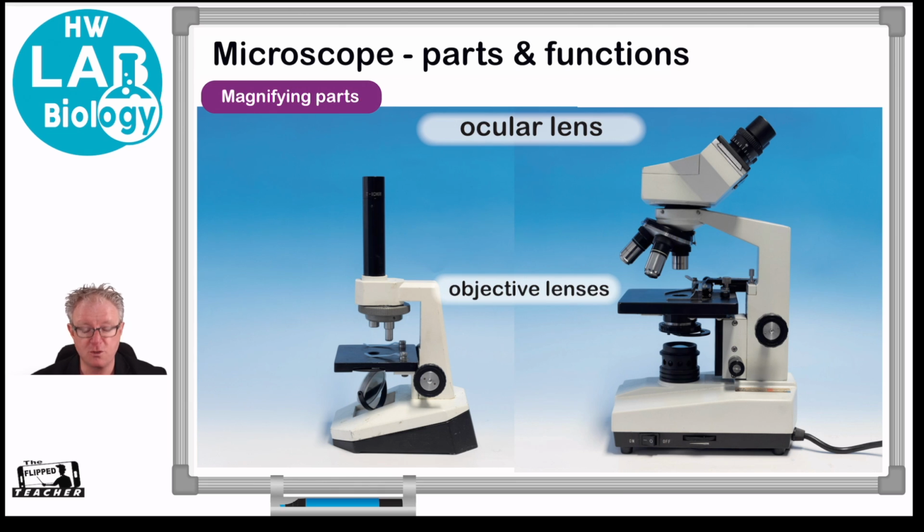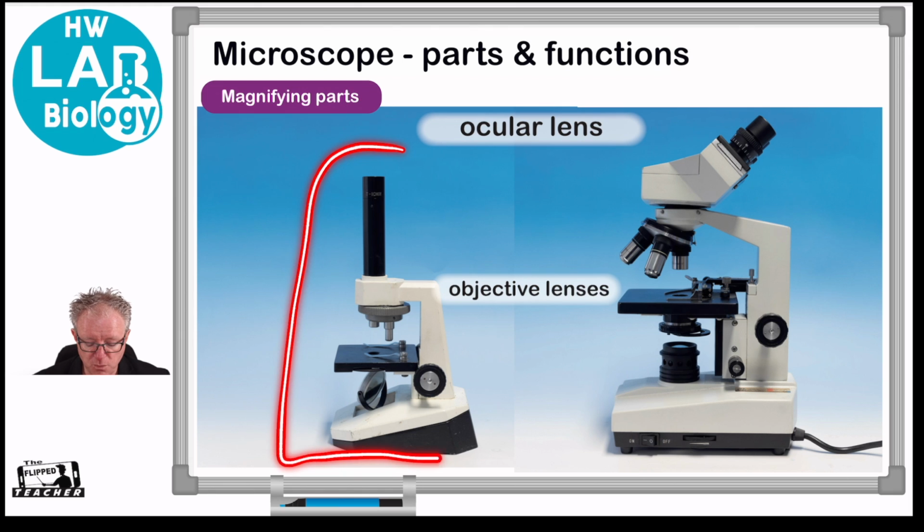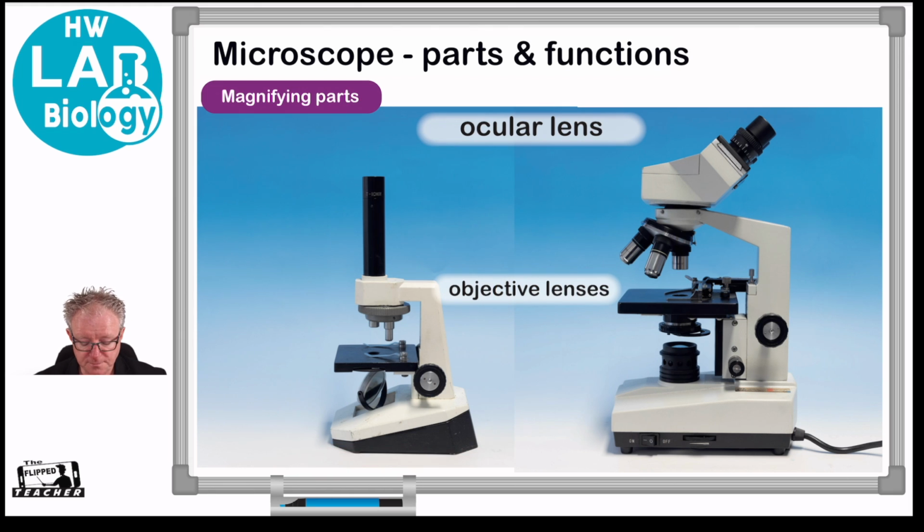Well, here we have some examples of compound microscopes because they've got one lens up here and another lens down there. So there's two lenses that you use. This one here is a very simple one you see in very junior science labs, okay, where we're just using light from a light source. Could be just the light from the window, or it could be a lamp, and that light gets bounced by the mirror up. Whereas this one here's got an integrated light into the actual base of the microscope, so it's more expensive. It's a compound microscope, but it's also a binocular. Here's got two lenses, two eyepieces there. Okay, so it's a binocular version. So we're going to look at the parts because they're similar between the two.